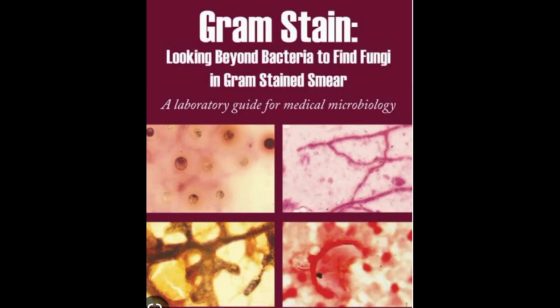Smear for gram staining purpose determines and confirms the presence of bacteria and yeast to establish the presence of potential pathogenic organisms. 2. Gram stain is essential in evaluation of all suspected cases of bacterial meningitis. 3. Gram staining smears are also scanned for the presence or absence of pus cells indicative of infection and squamous epithelial cells indicative of mucosal contamination.